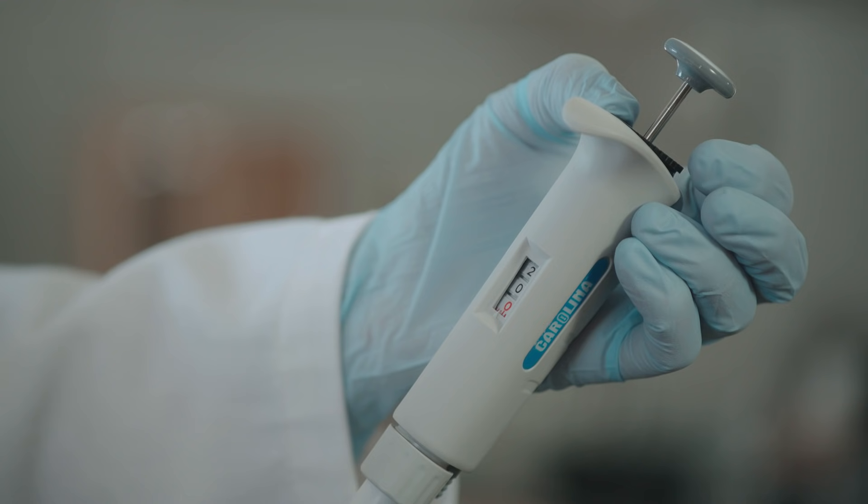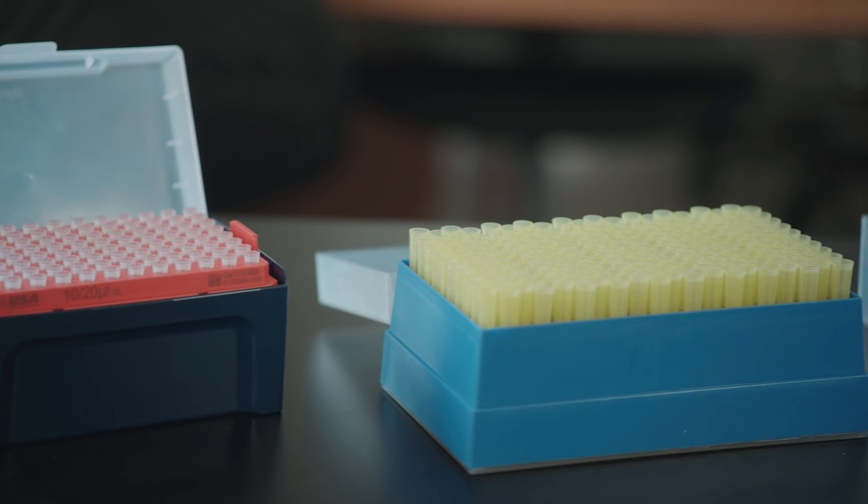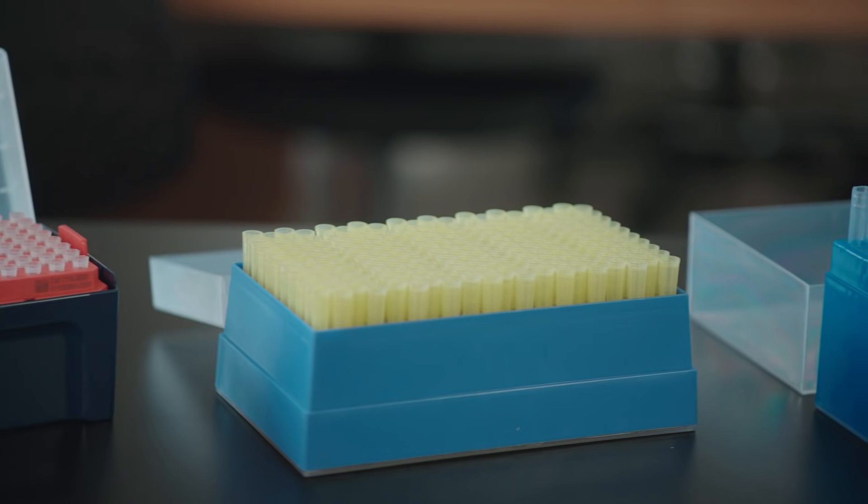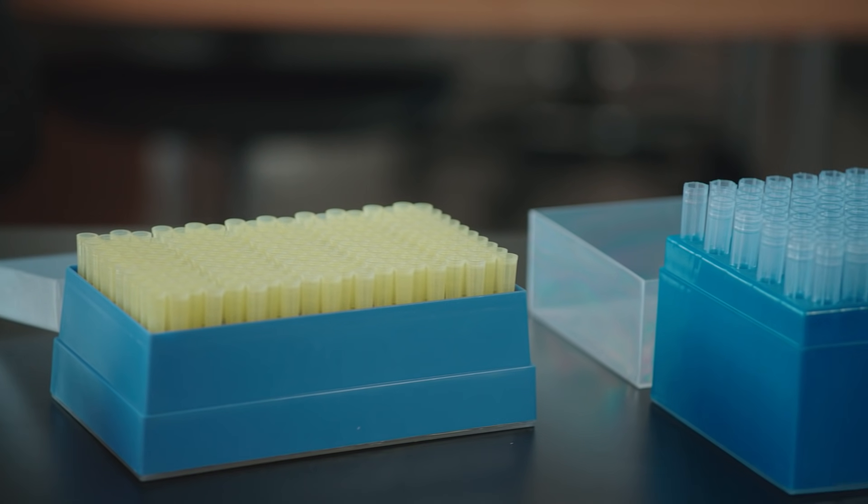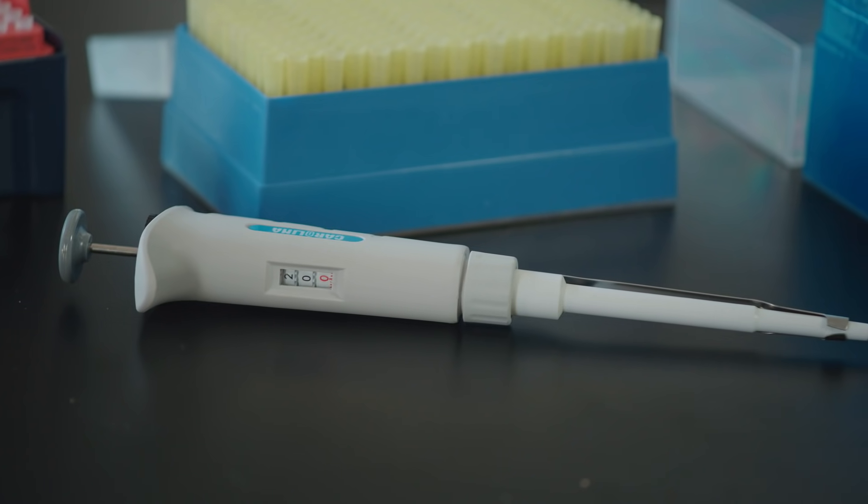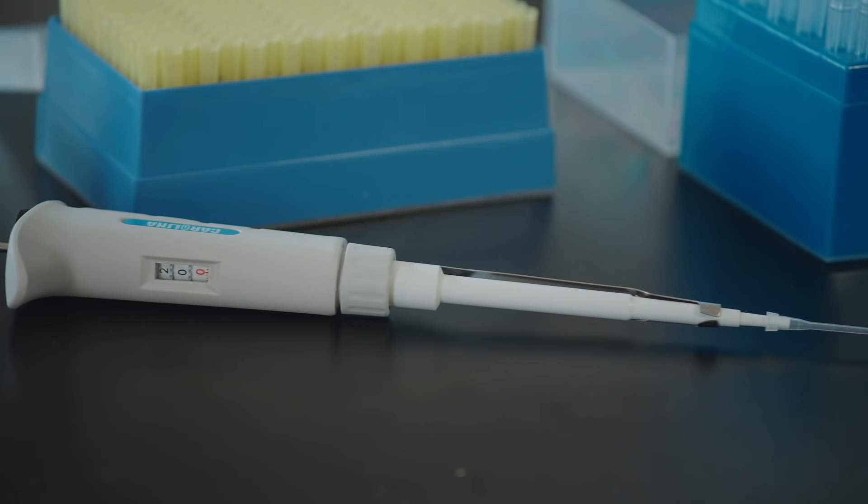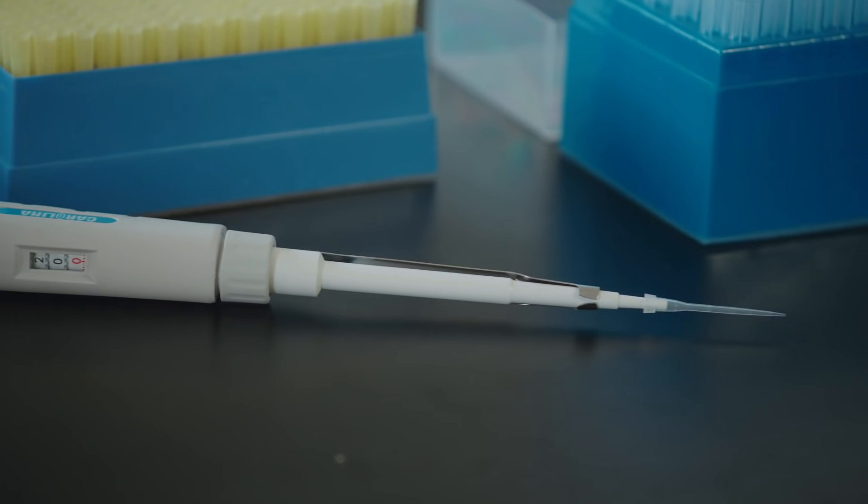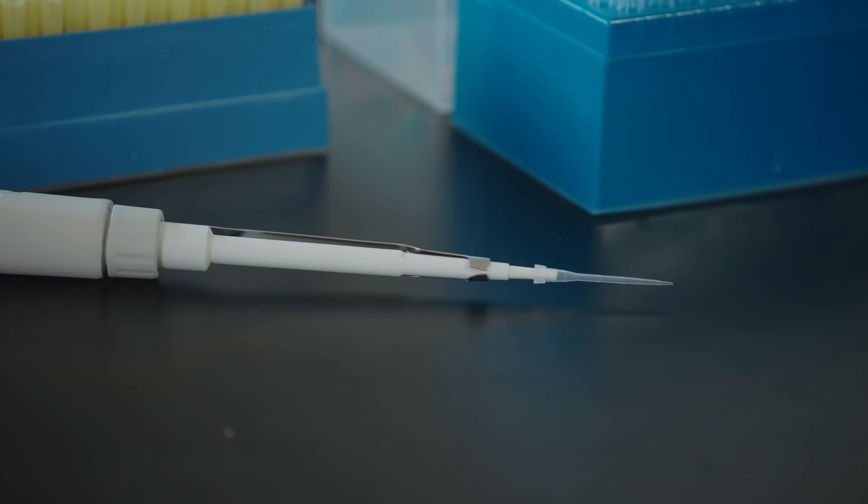In order to take up the indicated volume of fluid using the micro pipette, you must first place a disposable plastic pipette tip onto the end of the pipette. Different types of tips are used with different micro pipettes. This clear tip is used with this P20.